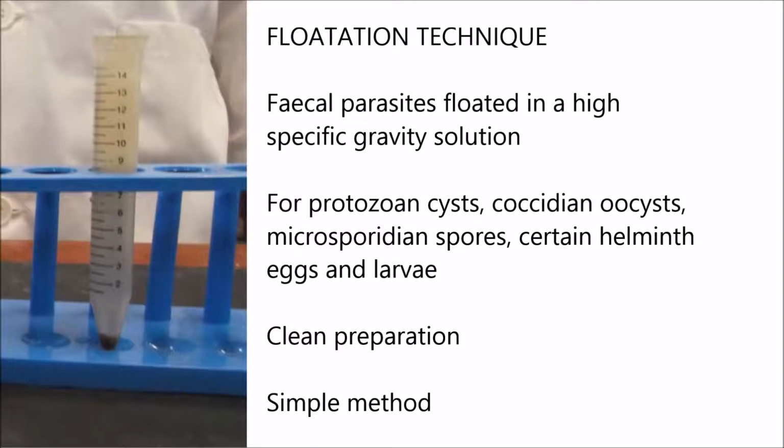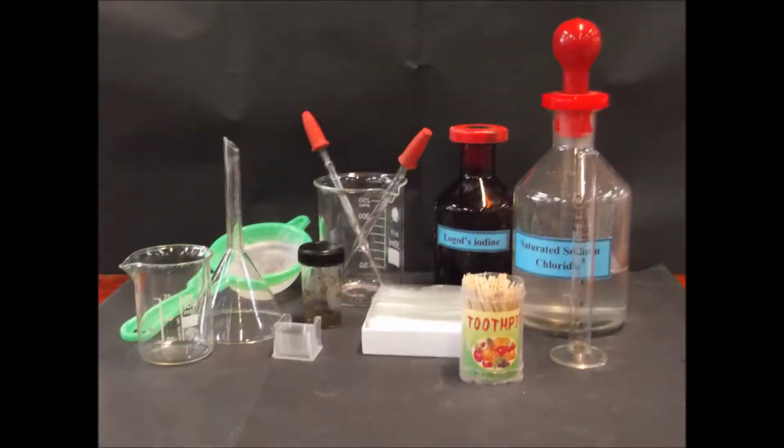Flotation techniques give a cleaner preparation than does the sedimentation procedure. And it is a simple method that does not need any sophisticated instruments. The materials required for the procedure are shown here.